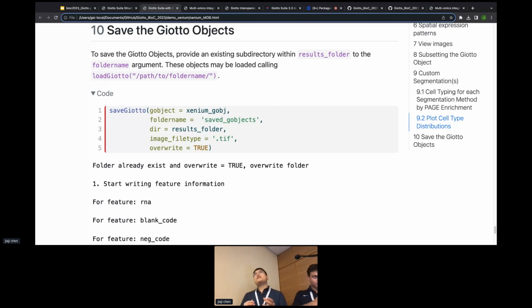This does not mean that you can actually do subcellular methods with non-subcellular data, not unless you want to do something like impute some data. That's going to be something else entirely. But we have all of the tools, so that's why it's technology agnostic.